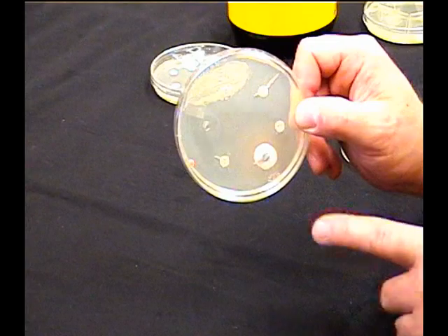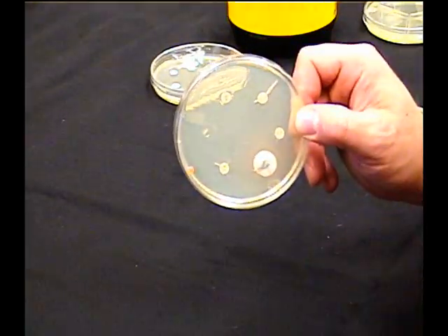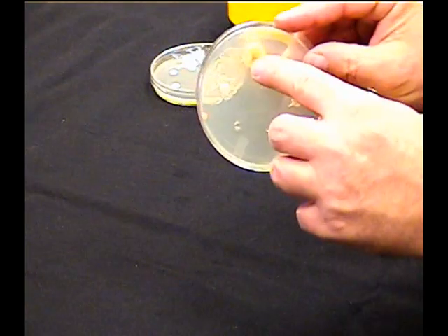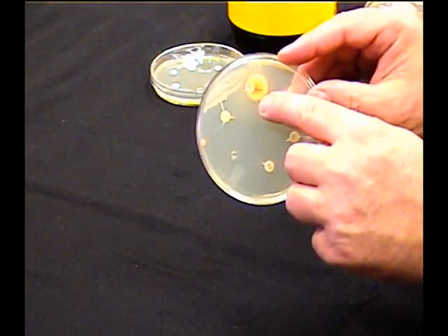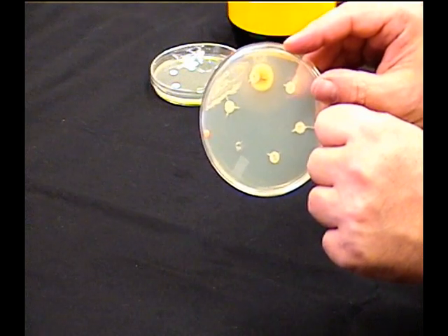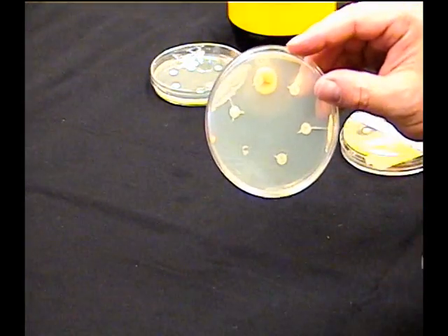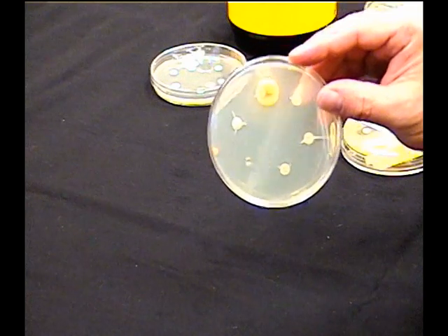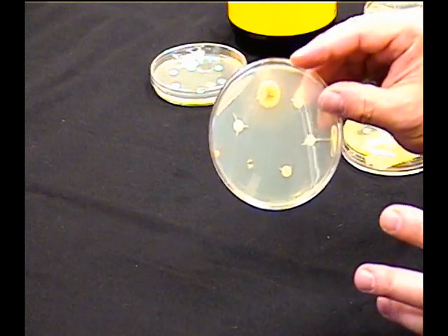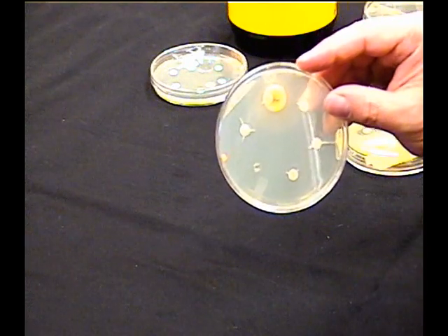The thing is, all of these are antibacterial antibiotics. Obviously, considering the fuzzy's grown right on top of a disc, they don't work so hot on fungi. So in order to do something against fungi, we would have to do this with antifungal discs instead of antibacterial discs.